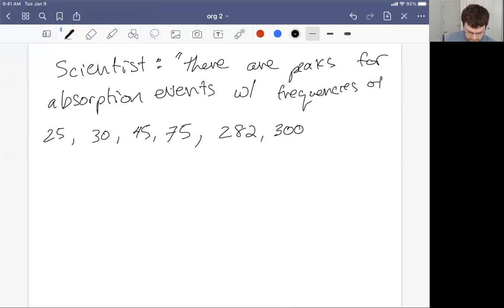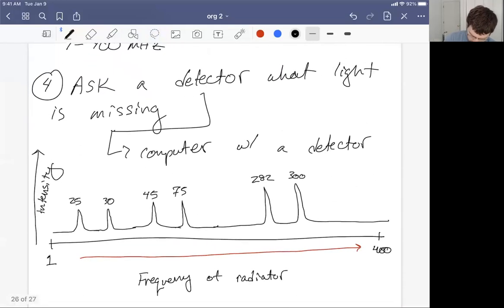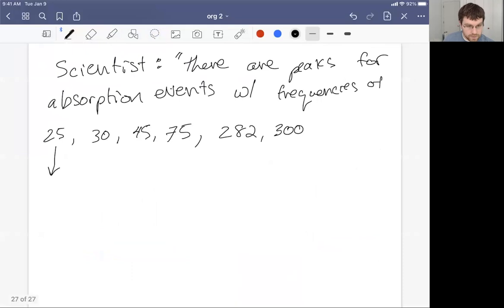Now, what this corresponds to is, did I label these as peak A through? I didn't. Okay, that's okay. So the 25 peak, we could refer to our notes and be reminded that at 24.5, we're going to see 37Cl. It's actually 24.5. So it's a little bit off. I'm sorry. Let me get this clarified here. 37Cl.